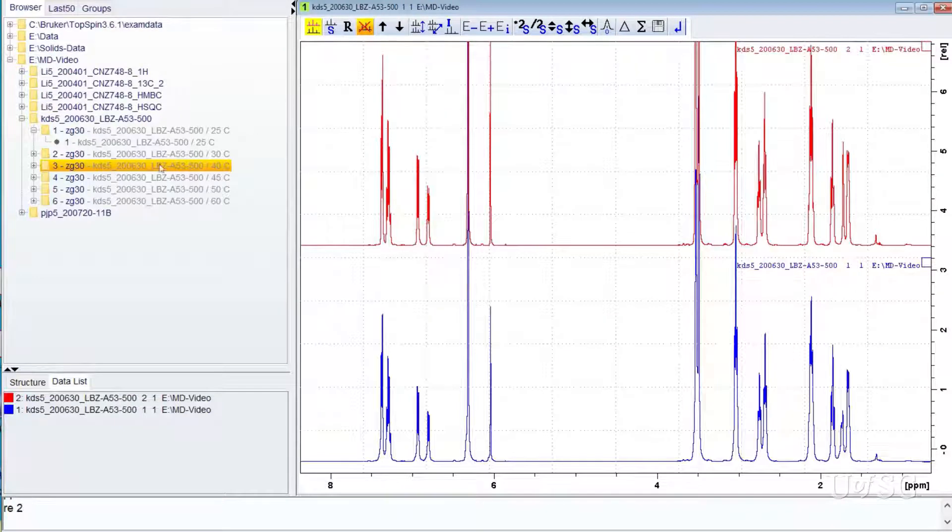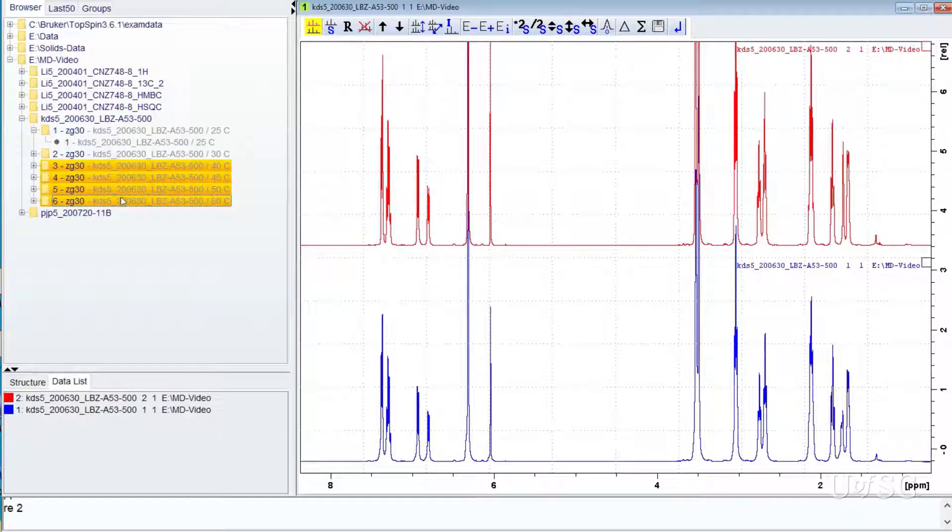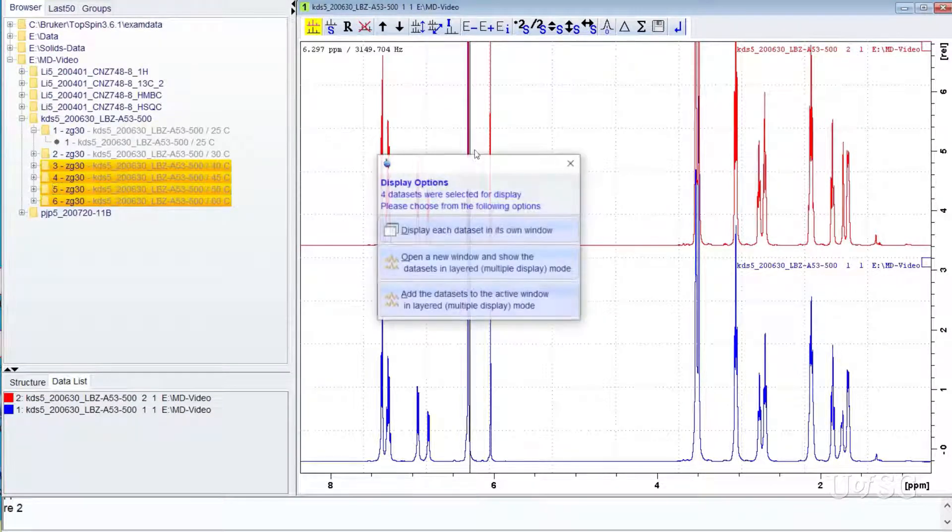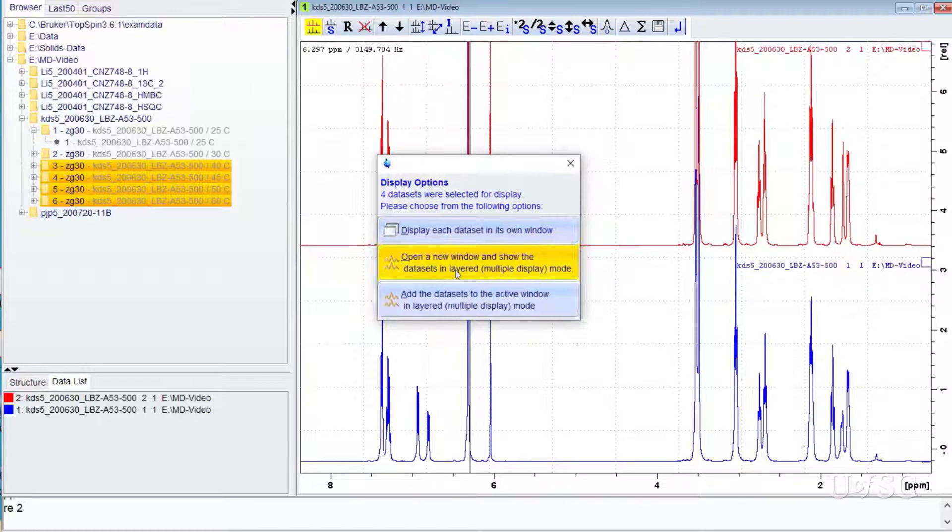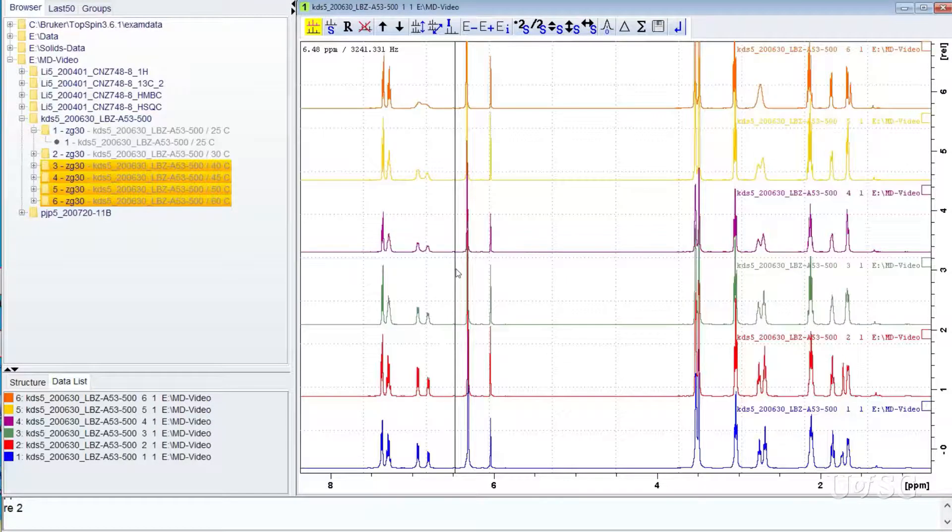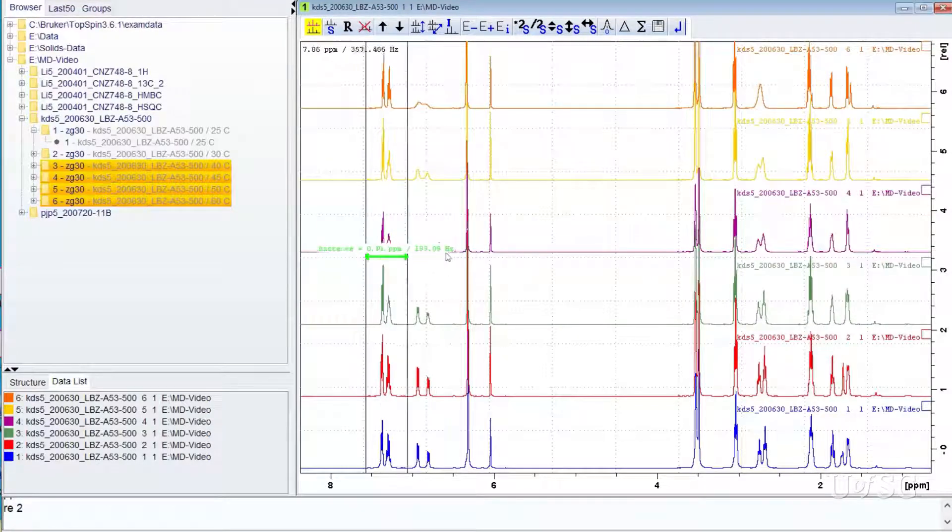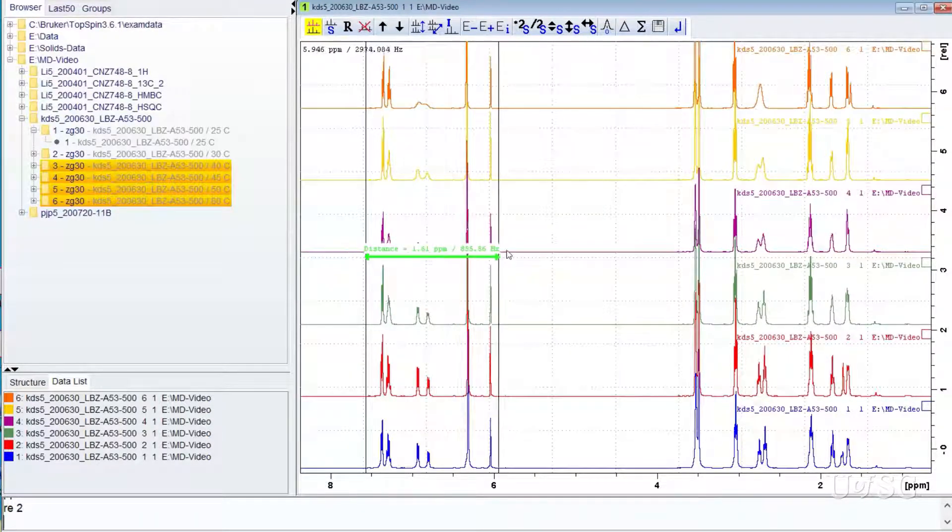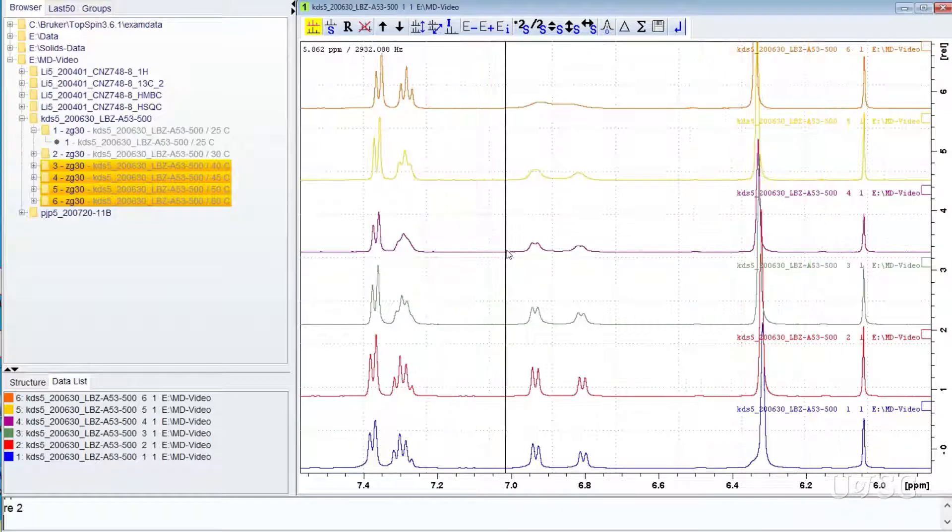To demo other functions, let's make multiple selections in the browser panel and add them into multi-display mode. Click, hold, and dragging the mouse cursor will make a chemical shift expansion on all the traces.